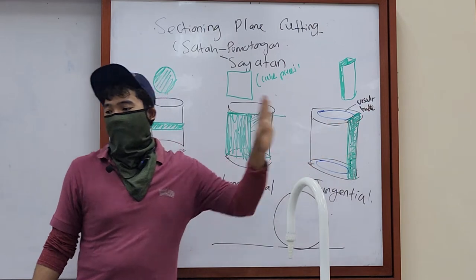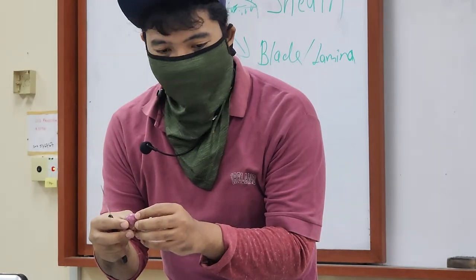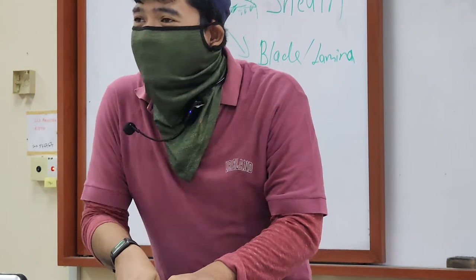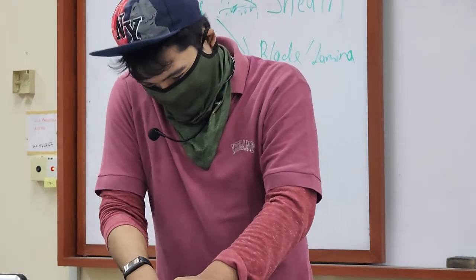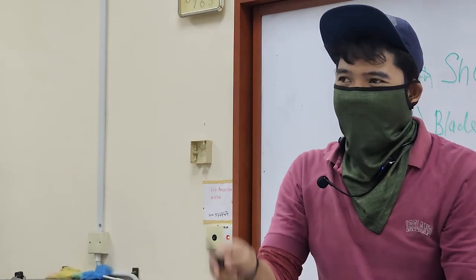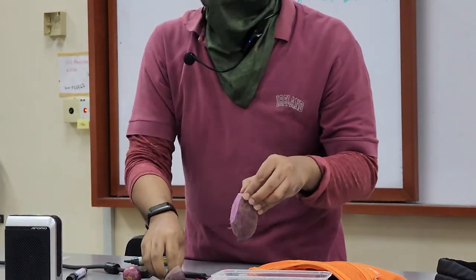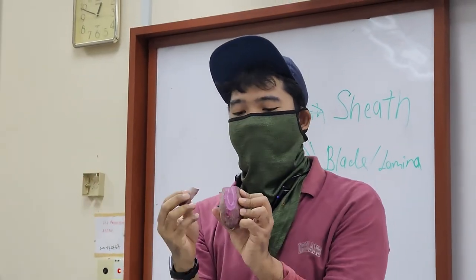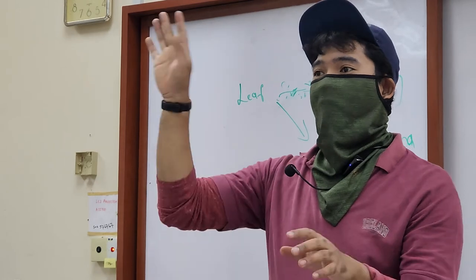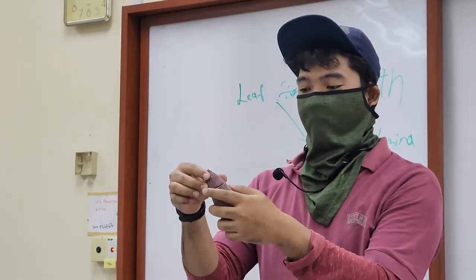So this is why it is called the tangent. So for this guy here, the tangent would be, well, that's not, maybe I use this one. It's my foot. You see, there is a circle in the middle here, the white circle. So I cut it just before the circle, like this. Yes, this part here, this is the tangential, because it is tangent to the white circle inside of here. Okay, just that. All right. So if you want to do your anatomy later, remember which sections are you referring to.